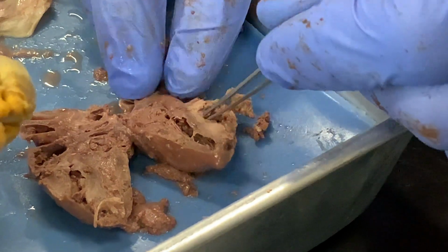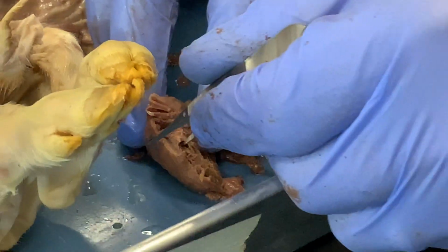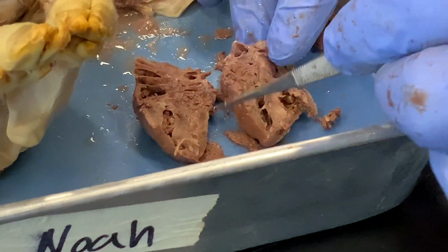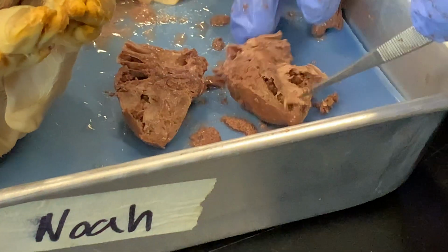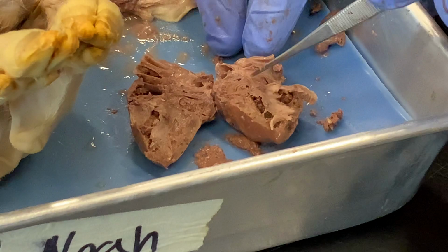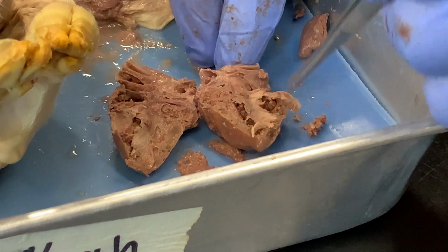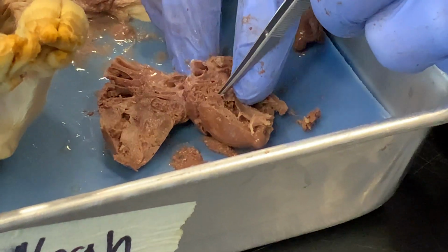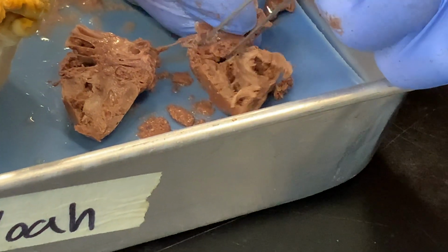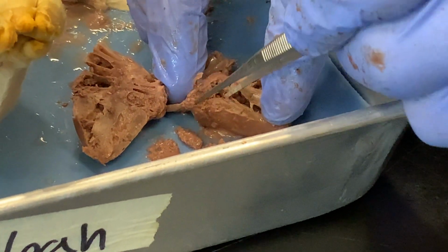When that contracts, the excurrent for that, or the way that blood leaves that portion of the heart, is through the pulmonary arteries, which are on the back side of this, not very visible. And they split and go to the two lungs. Blood drains back from the lungs into this chamber right here, which is the left atrium. Again, it has a chunk of coagulated blood inside of it that we will remove so that you can see that it is actually a chamber.